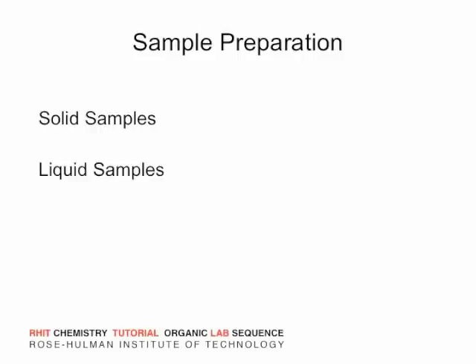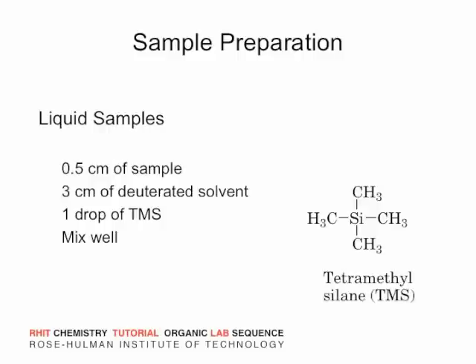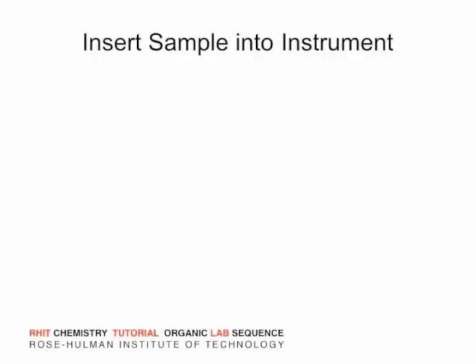If you have a liquid sample, the procedure is similar, except that you should use a pipette to place the sample into the NMR tube.